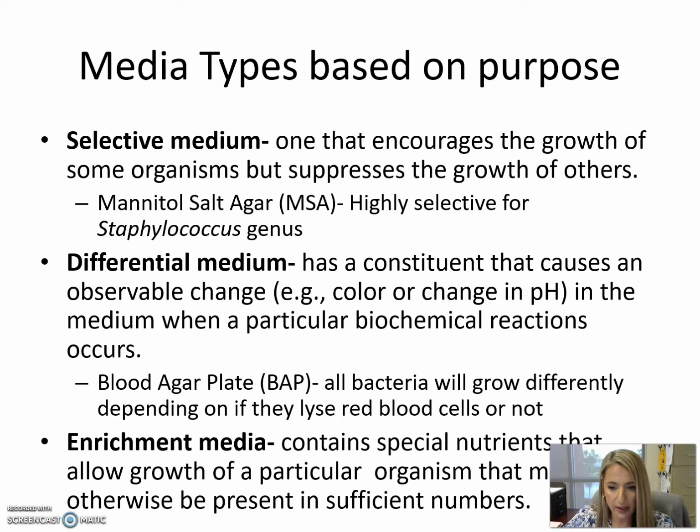So there are different media that we can look at based on purpose. There's selective media, differential media, and enrichment media. So with selective media, there is some type of inhibition process. With selective media, these are plates that are going to encourage the growth of some bacteria while inhibiting the growth of others. So it's kind of in the name. In a selective media, the plate is going to select for the growth of specific types of bacteria, and then others would be inhibited.